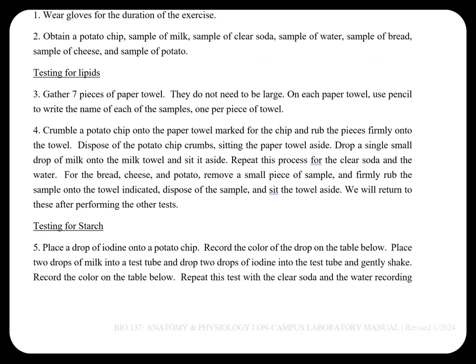You are going to take 7 pieces of paper towel, just a little bit bigger than postage stamp size, and you're going to put 1 of 7 samples. On one of them, you're going to put a potato chip. Another one, you're going to put some drops of milk. Another, you're going to put a clear soda like 7-Up or Sprite. And then one's just going to be like a control, and it's just going to have water in it. Then you have a sample of bread, cheese, and potato. So those are your 7 samples that you're going to be testing.